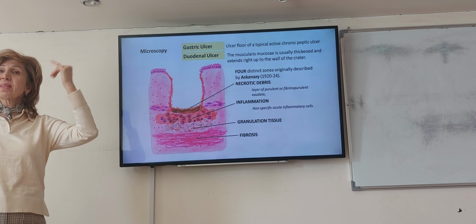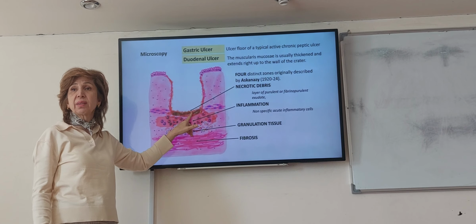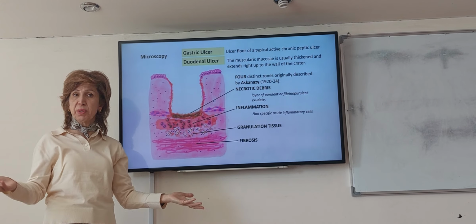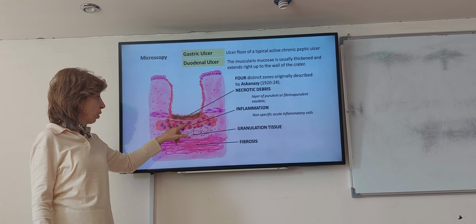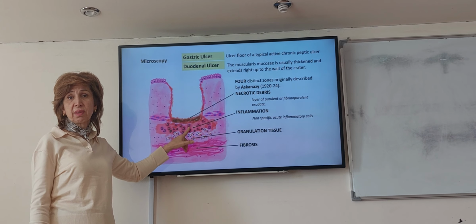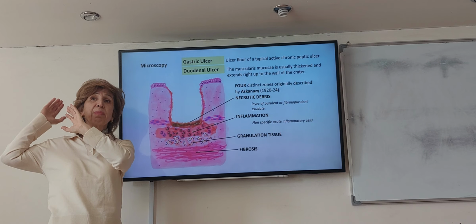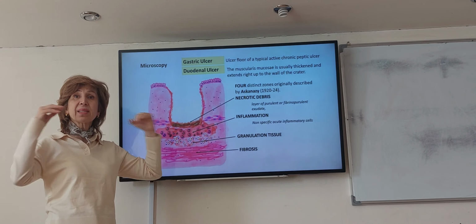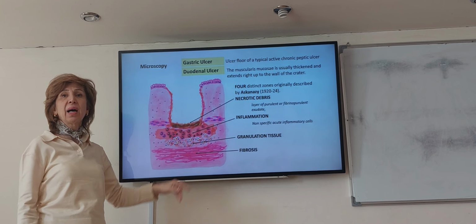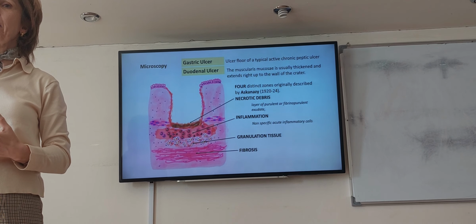Now this was started with necrosis, acute, etc. So what I will see, necrotic debris. Yes, this is how it started. Every necrosis will try to bring what? Neutrophils. So necrotic debris and neutrophil infiltration, this is from the beginning. But once the body starts to try to cover, I will see granulation tissue formation, which is many capillaries.